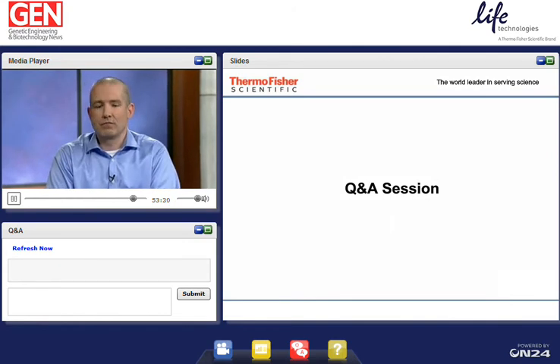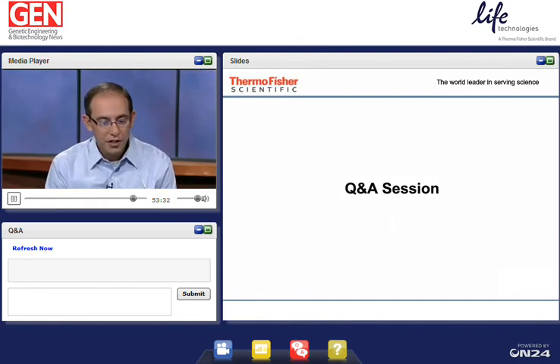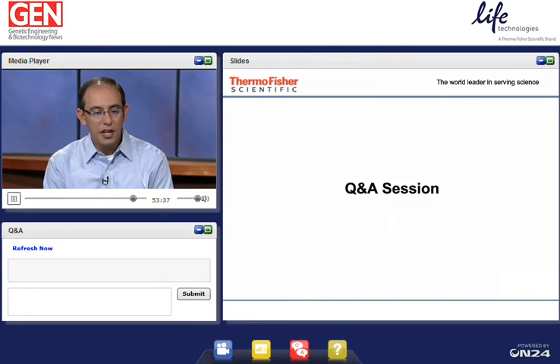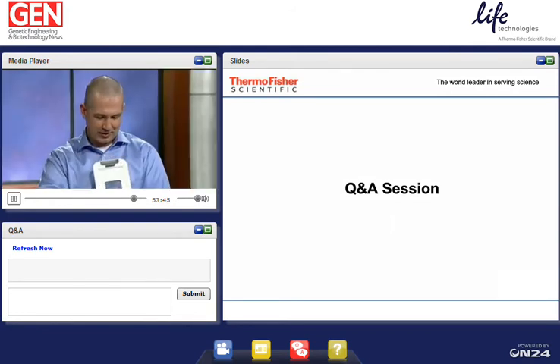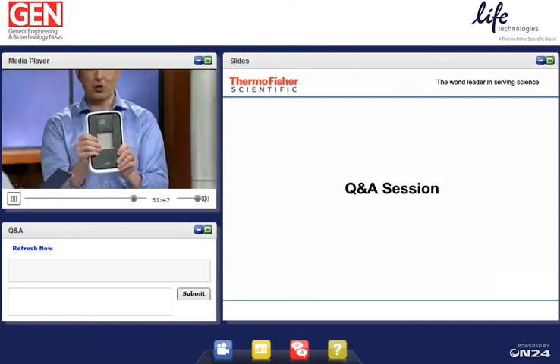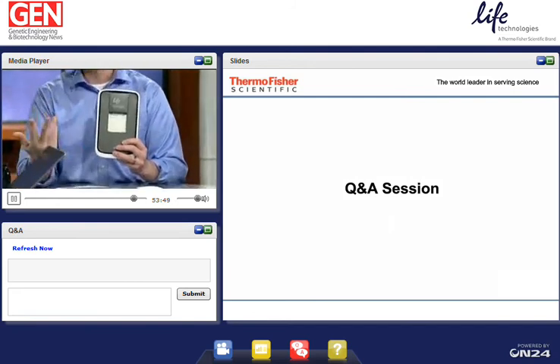Great. We have another question here from Karen at the University of Missouri. I use a directly conjugated primary antibody. How can I still use iBind with that type of protocol? I hope the cameraman can help us out here. What I'm going to do is just show the device. But yes, you can. Absolutely. We get that asked all the time.